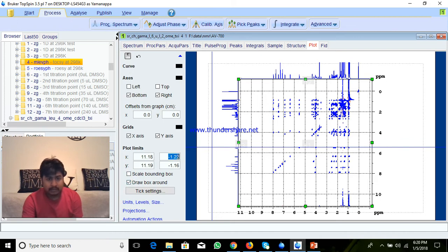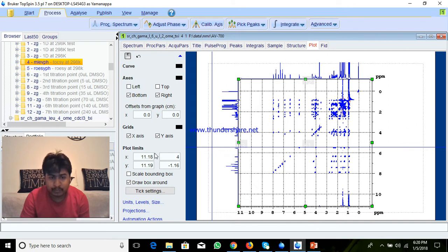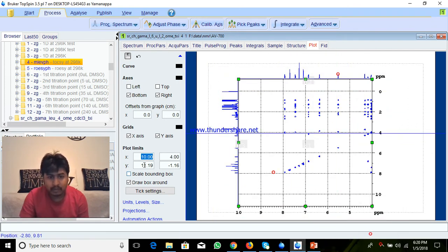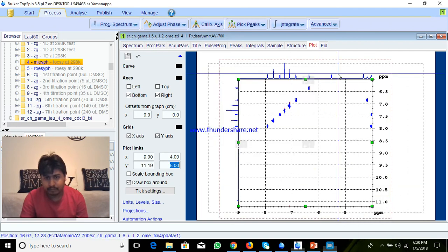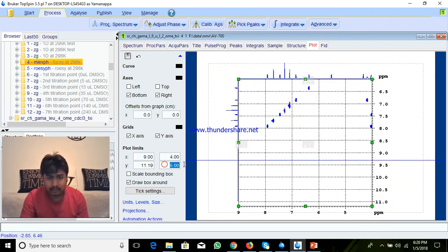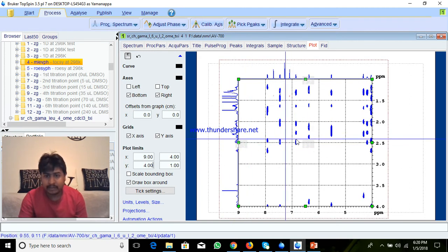Here also I will give from 1 ppm to 4 ppm. When I enter that, you can expand like this. If you don't want, I can Shift+Escape to make all spectra again. You can select the expand option and left-click and drag how much area you want to expand, so you can expand like this.